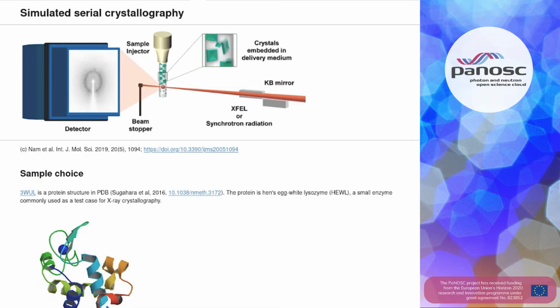If we want to try out some of that code, we can start by giving it simulated data. In a simulation, we can ensure that every frame has a clean diffraction pattern from a single crystal, so it's easier to analyse than data from a real experiment. You might do this to learn to use an analysis tool, or as a test case for analysis code that you're developing.